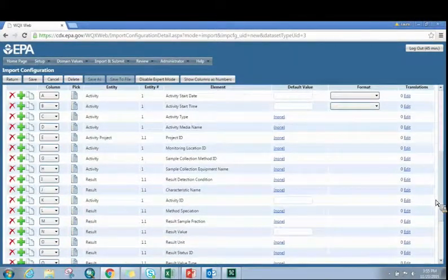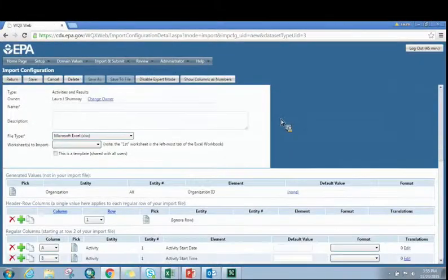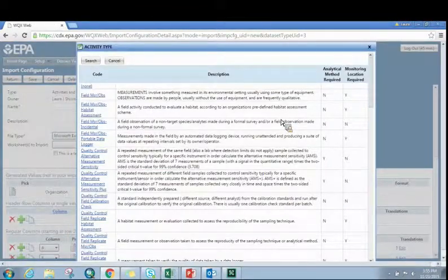So it said activity type. Let's look at what activity types are. What are examples of activity types? This is why I said we're assuming that this is all probe data. So if it's all probe data, it's field measure observation, this first one. But that value does not exist in our data set. So what we're going to do is create a generated value for that measurement.